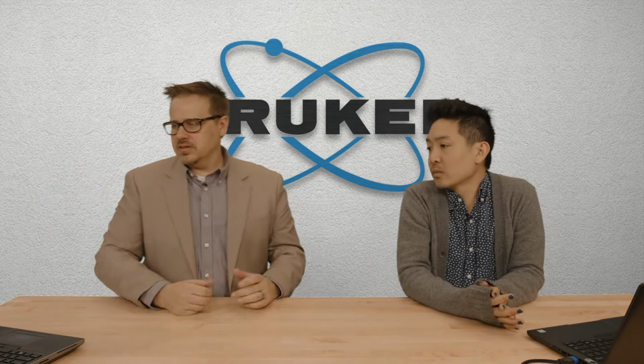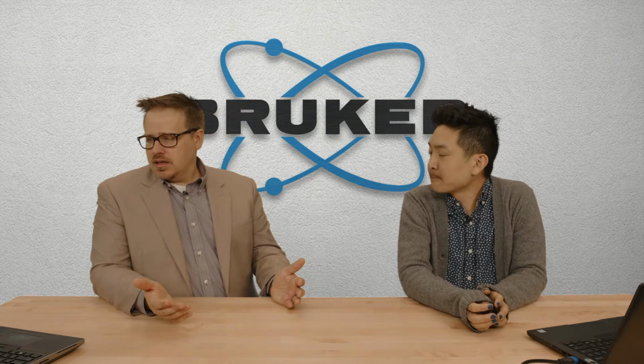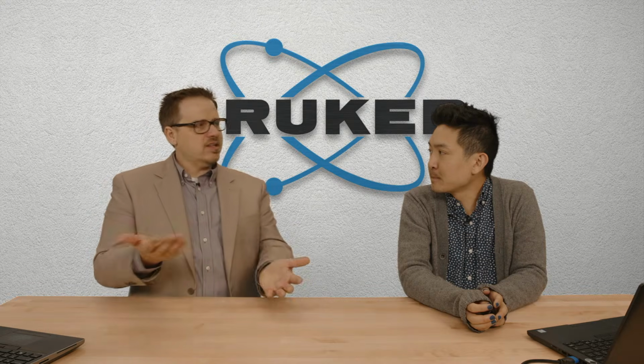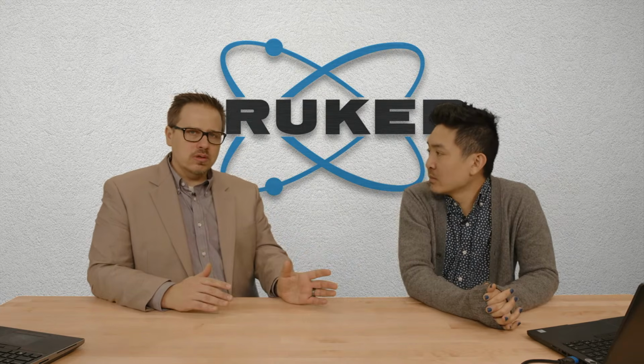And say as a materials person, metals, what I think about when I hear solid solution, I think, oh, you're looking at D spacings, probably. Oh, yeah. Zinc and copper. Yeah. And what happens is, as you change that composition, it's going to change the lattice parameter. You're thinking about Vegard's law. In this software, what's kind of neat is you can actually tune the cell.